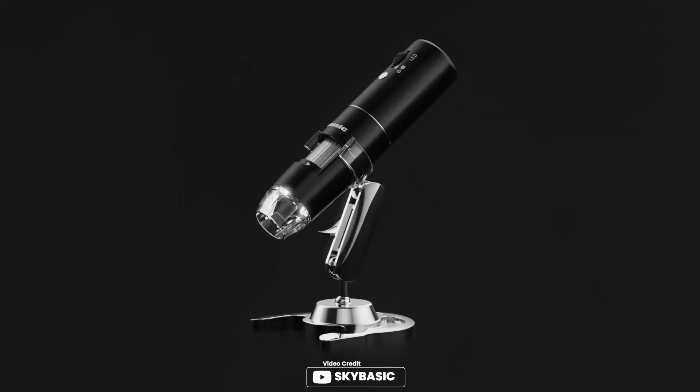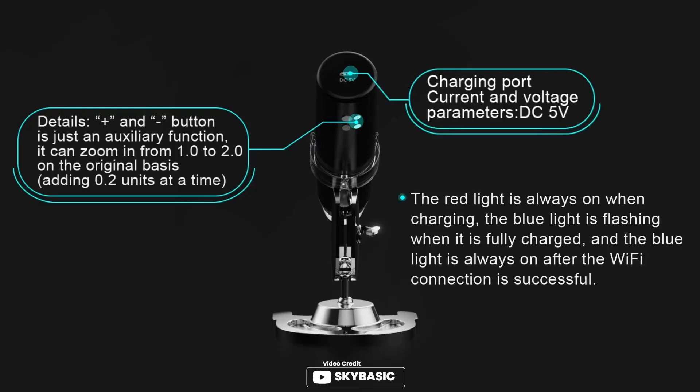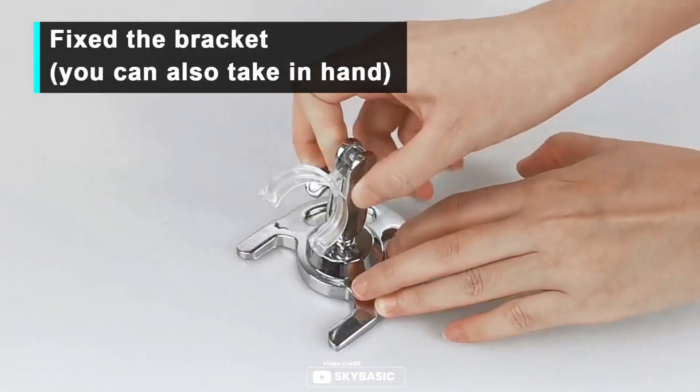Looking for an electronic microscope to study plants, materials, or insects? Look no further than the SkyBasics Wireless Digital Microscope. With its 8 adjustable LED lights, it provides excellent digital and optical clarity, allowing you to take images with 1920x1080 resolution for smartphones and 720p for computers.